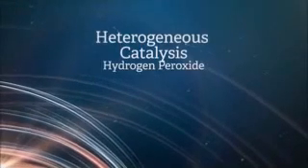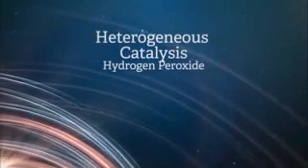Today, the aim of the experiment was to discover the effect of surface area on the violence of a reaction. The result of this aim is to be determined by the comparison of intensity of each reaction for the hydrogen peroxide catalyst experiment when two different surface areas with the same mass of reactant are used.